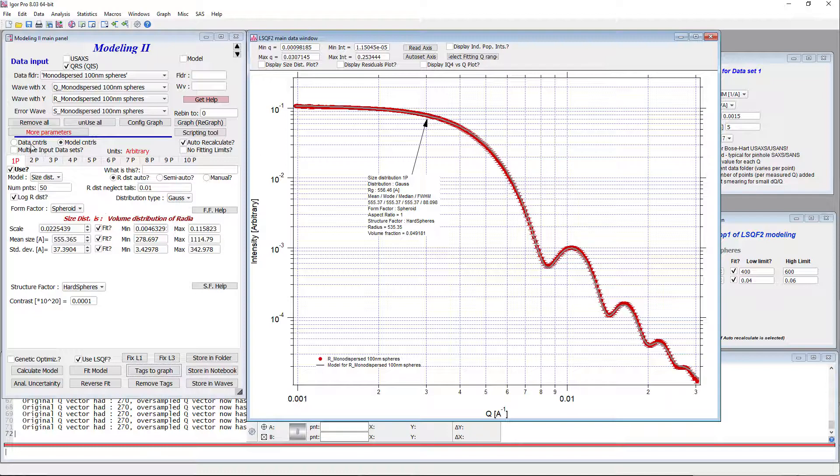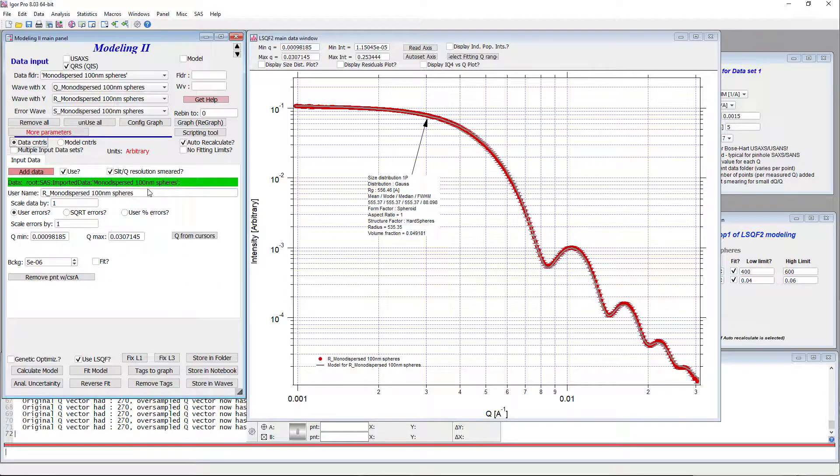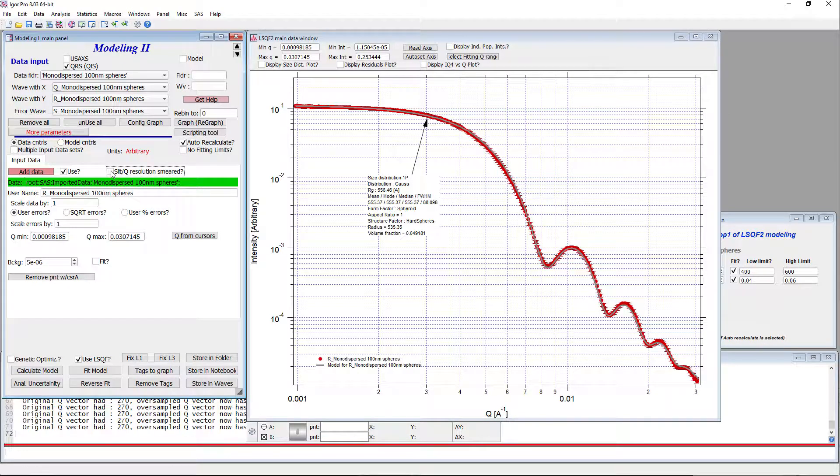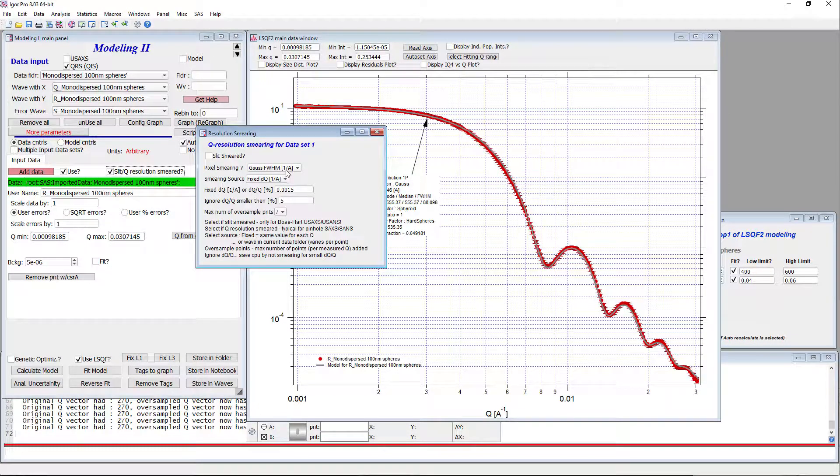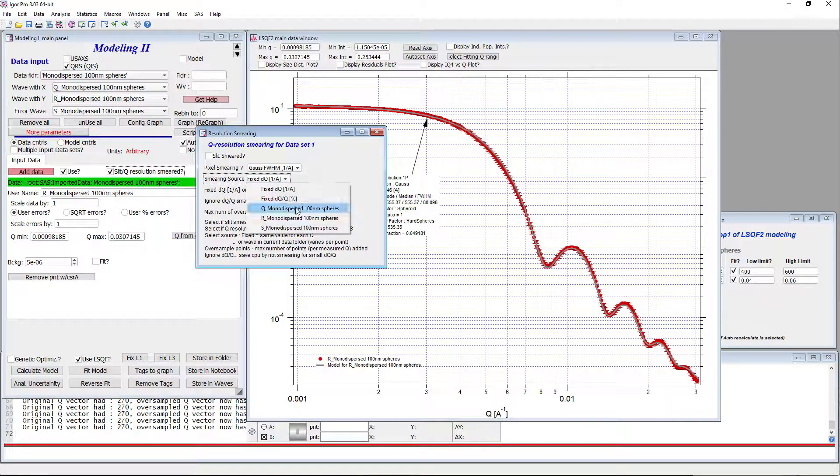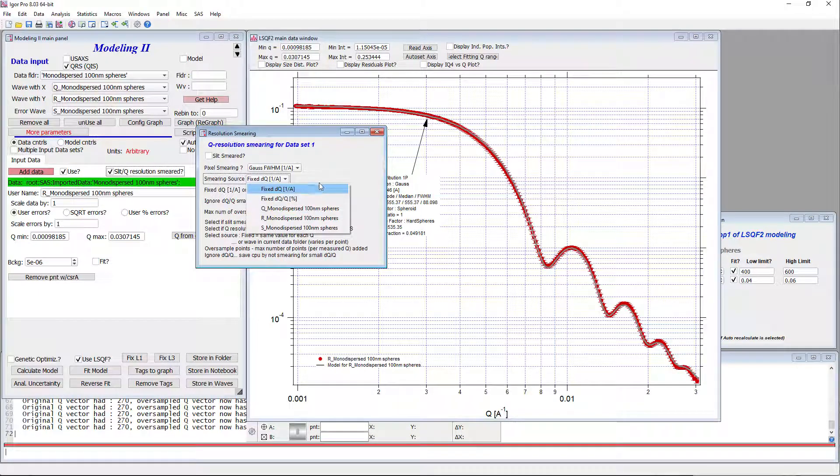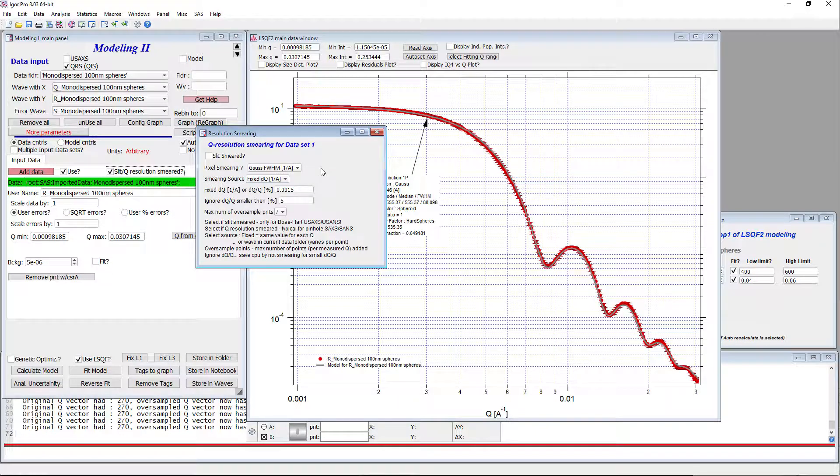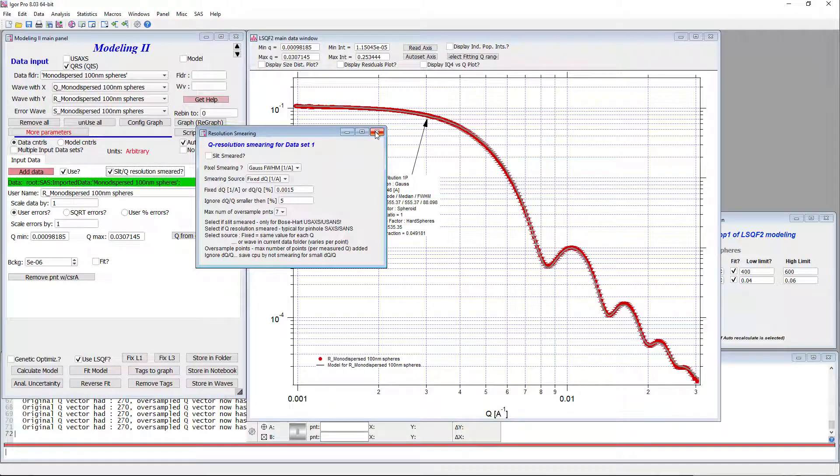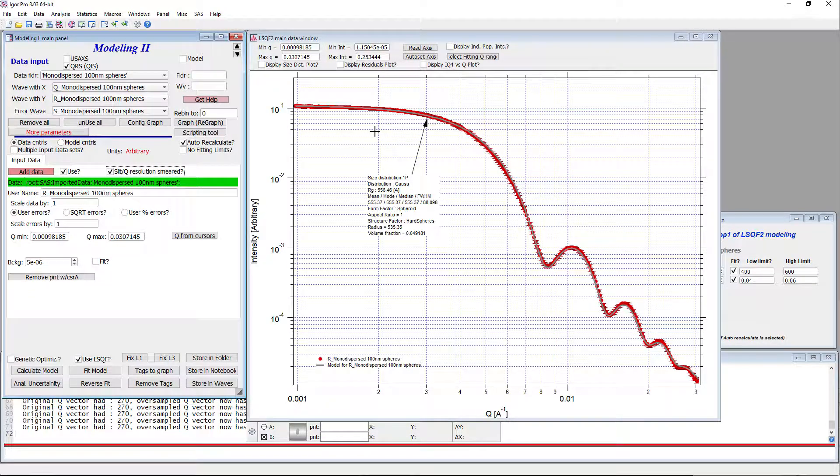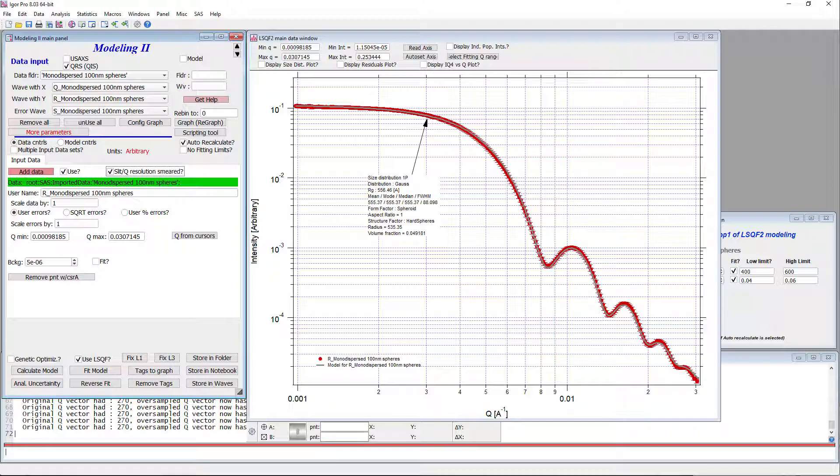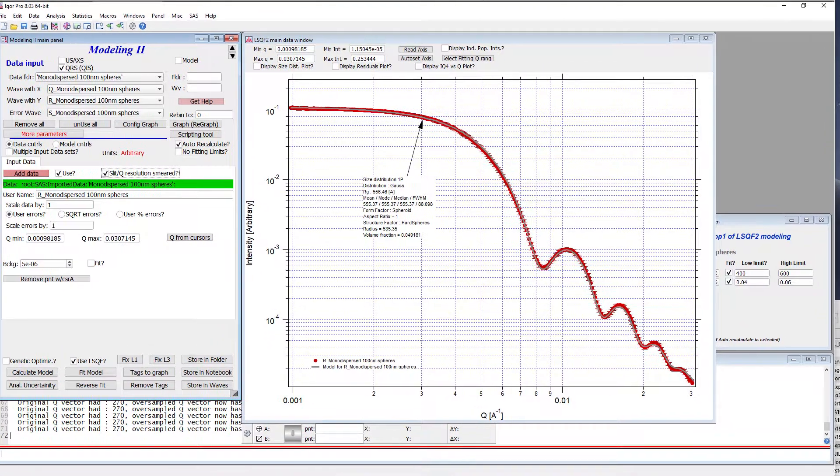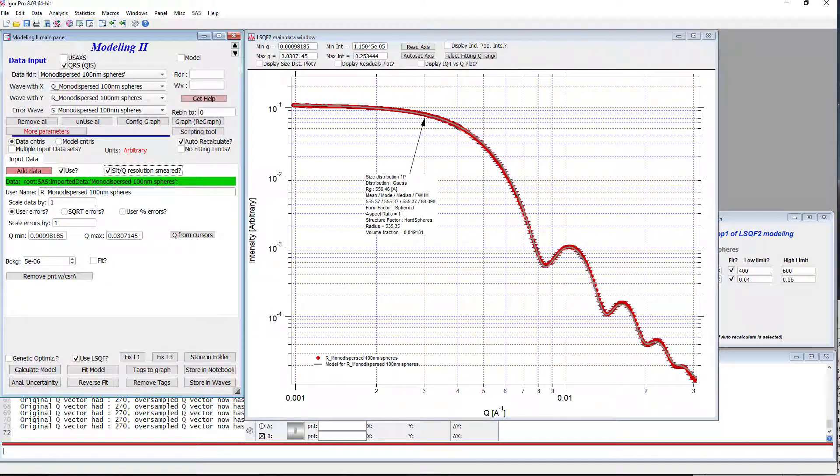If this data came from Nika with Q resolution, we could go in and we could select here that the source of the smearing is a wave, which would be available here. So we would have a wave. There would be basically a number for each point which IRENA would be able to use. Anyway, so that's the result. I will now post this on YouTube. I will also make this data set available on GitHub. So anyone who wants to play with this and fit this with their own IRENA package can do it at home and follow this movie and see what needs to be done. Well, thank you very much and next time.